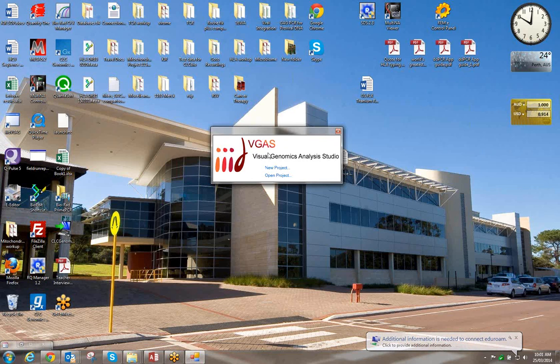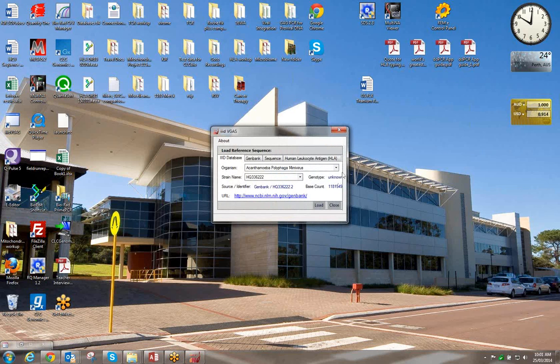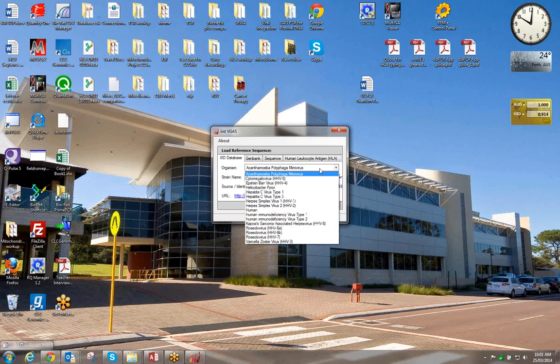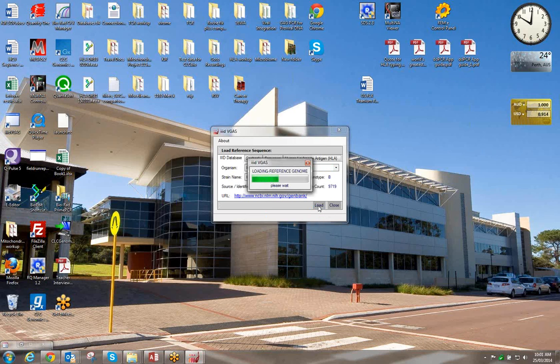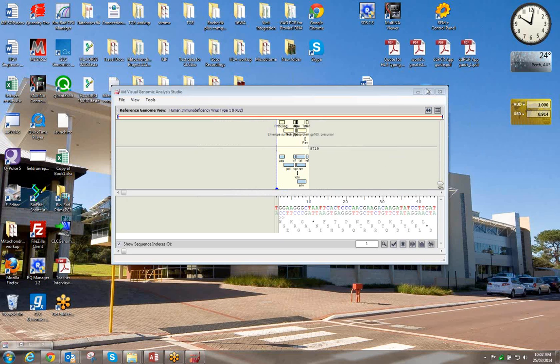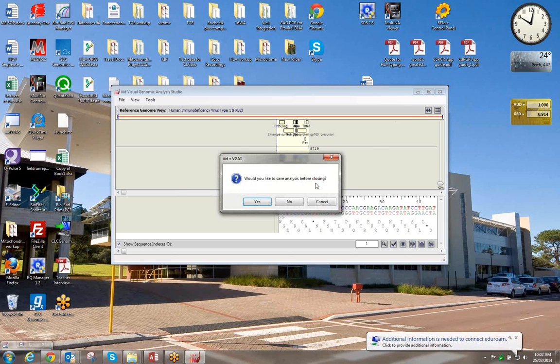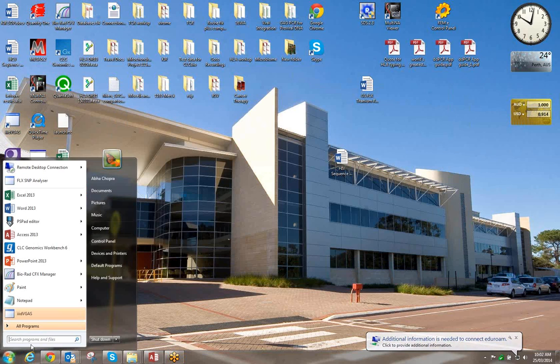Shay is going to control the mouse and take you through the new project. If you have sequencing data, that's how you start — go to new project and then choose the reference sequence or organism for the analysis. Here we've got HIV-1. You load the reference sequence, which normally comes with the program, but you also have an option to download it yourself.